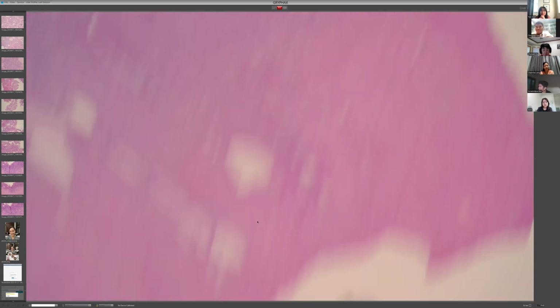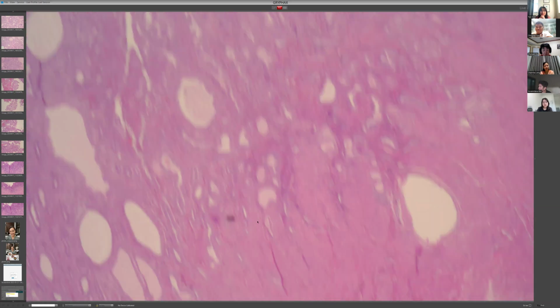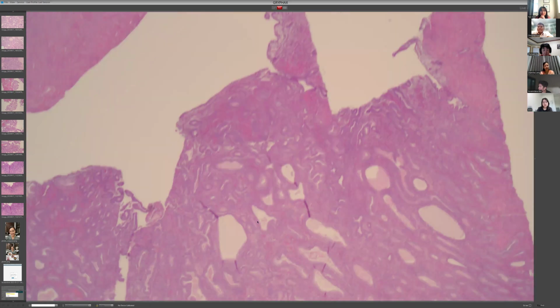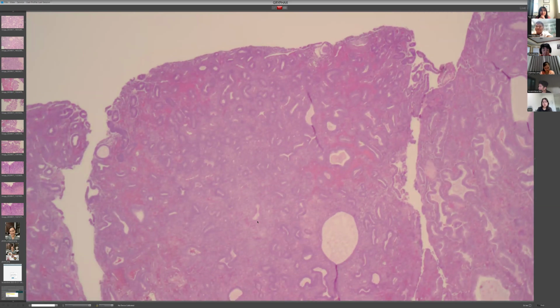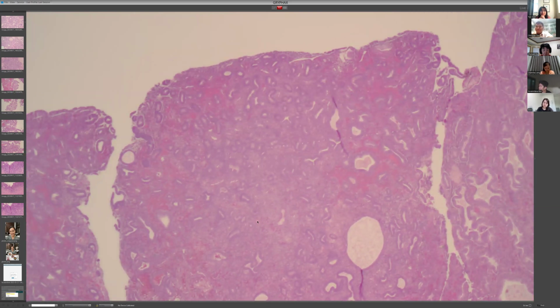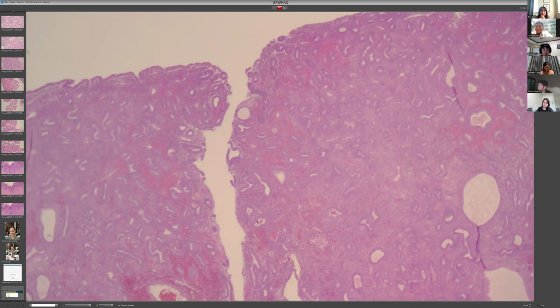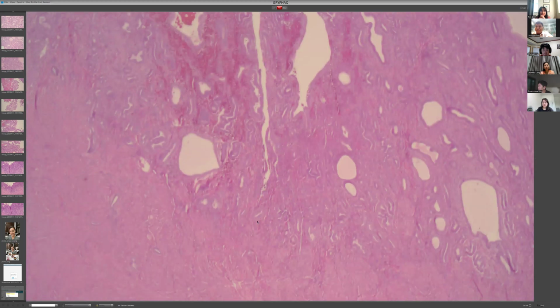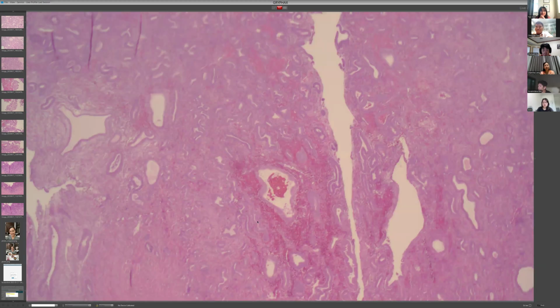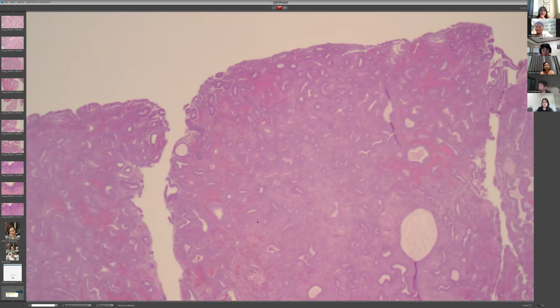I have the hysterectomy specimen, and this is a shave of the endometrium, because when we're examining endometrium, if we can't process all the endometrial glands, we do shaves. I don't know if that's a similar practice where you are. So this is just short strips of endometrium and a little bit of myometrial junction.